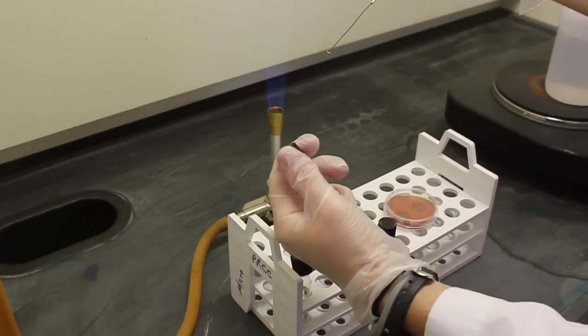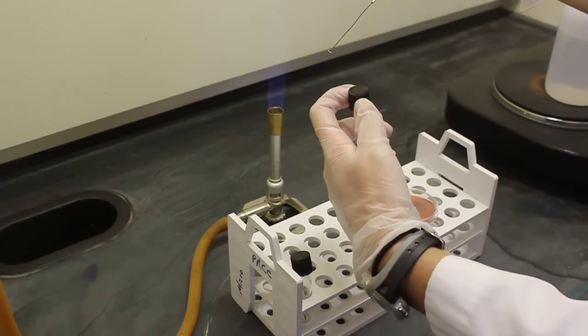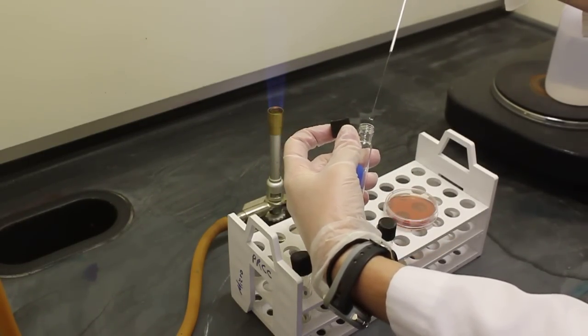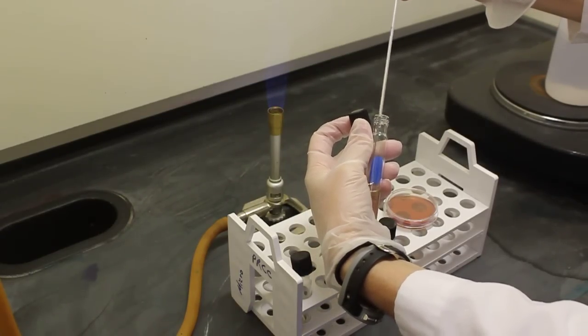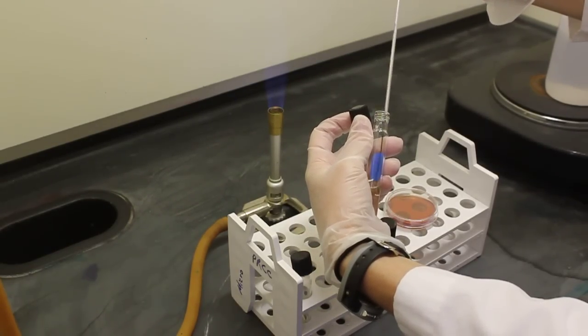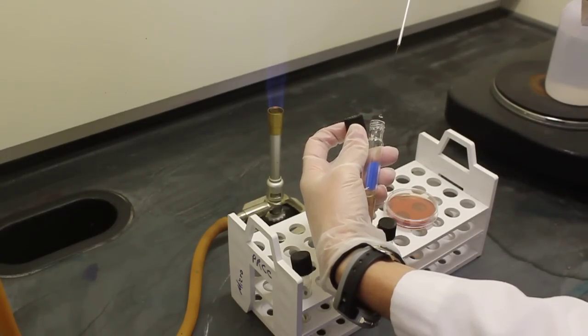I'm going to inoculate my broth. Open the broth carefully not to touch the top. I then dip the bacteria into the broth. You can shake it around a little if you like, even though you cannot see the bacteria coming off. I then pull straight out.